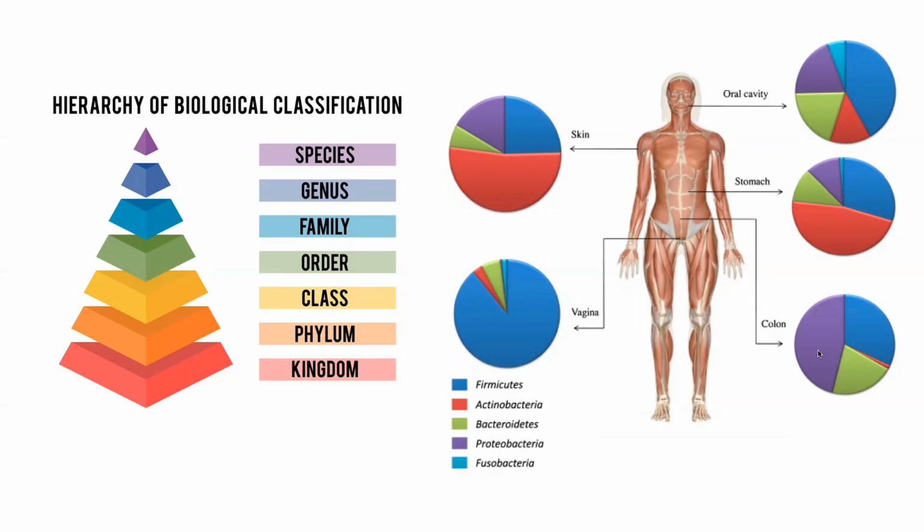Sometimes we just want to look at diversity, and that would be an example of using 16S amplicon ribosomal RNA, because we're going to be looking at amplified V4, for example, regions, or V4 and V3 regions. That will help us compare what's called alpha and beta diversity. So how much, based on species, for example, we have, and then we can compare them and understand the differences.